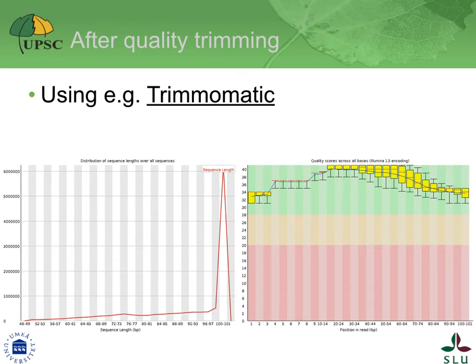To remove adapter sequences and trim bad quality bases, we use a tool called Trimmomatic. After running it, since it modifies the data, we re-run the quality assessment with FastQC. On the right panel, you can see the effect on the quality — it looks much better now. A side effect of the trimming, as shown in the left graph displaying the density distribution of read length, is that reads are no longer of a unique length. In that example, some have a size between 50 and 99 base pairs, instead of the initial 101.